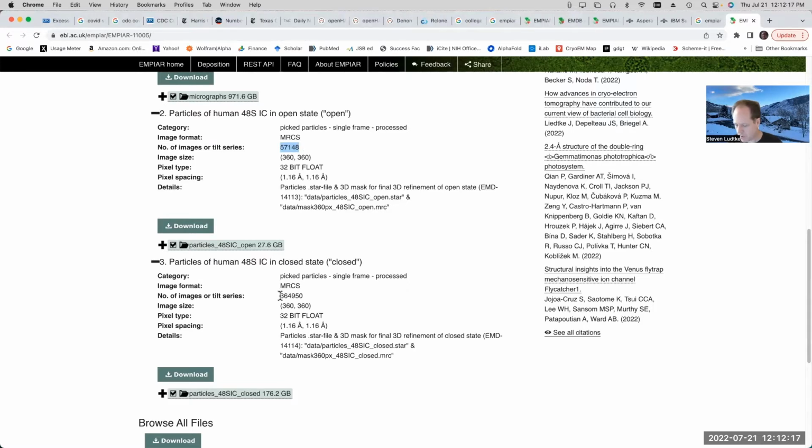Now, most of that is probably because of this data set, which is much larger, this closed state data set that's presumably intermingled with the open state data set. And this is a much larger population, but even here, you're really only talking about getting something in the order of 10 or 15 particles out of each micrograph. I don't know.